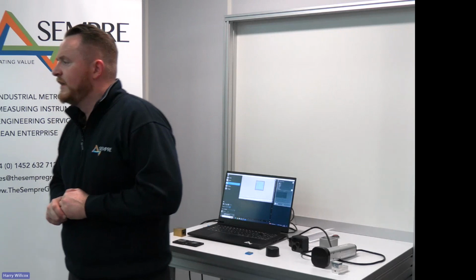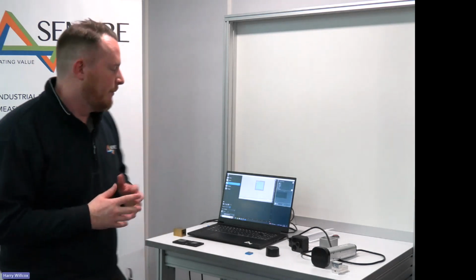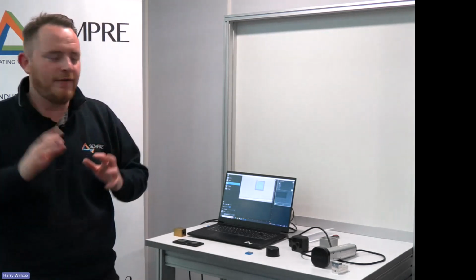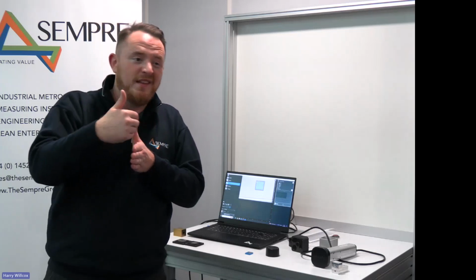Okay. I know you mentioned size of radius, etc., but what would be the smallest chamfer you can measure? I think it's the same principle, and I know it's a terrible answer, but we've got a resolution on the system in an X and Y position on the Gelsight Max of, I think, 2.8 microns to 3 microns. Don't hold me to the number, it's around that figure. So in theory, for the length measurement that you'd be looking at, we'd have the pixel spacing for that specific area. Within a measurement, you try and take maybe 5 consistent points within that field of view, depending on the requirement or the limit.